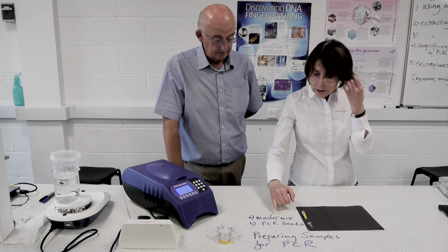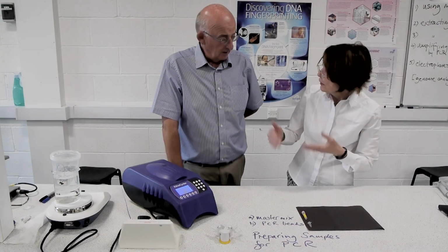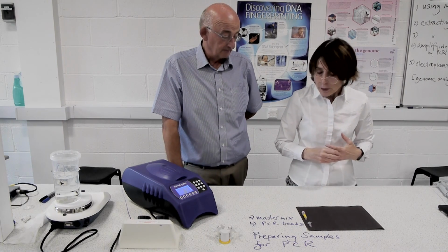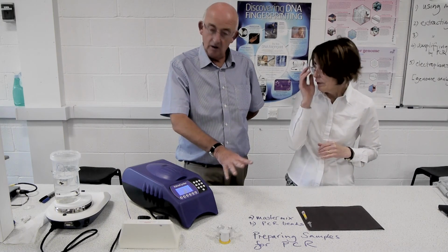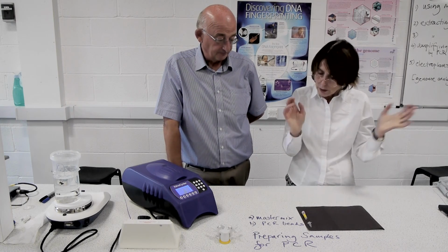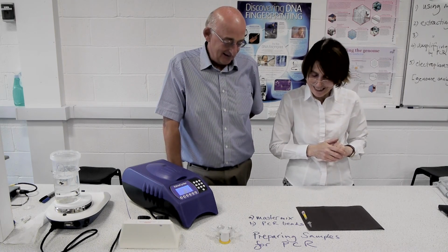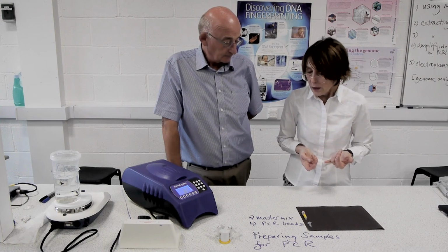Right. Both master mix and PCR beads contain the enzyme that does the copying of the DNA. It's called Taq polymerase. Taq polymerase can work at very, very high temperatures. There's a story behind the discovery of that, which we won't deal with at this point, but Taq polymerase was the key for this whole process. It can work at temperatures of 95, 96, 99, it doesn't matter. It's quite happy at those temperatures, which blows some of the enzyme theory out of the water a little bit, doesn't it?